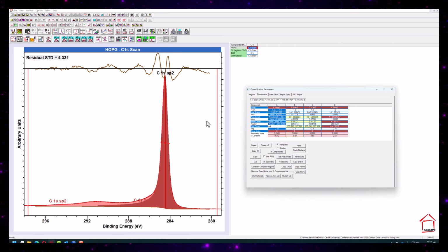Lock is a better terminology. Use the term lock in position constraints, and everything with the same component index will suddenly become A plus something. And there we are. There are the values that we roughly said before, about 6.5 eV and about 10 electron volts.